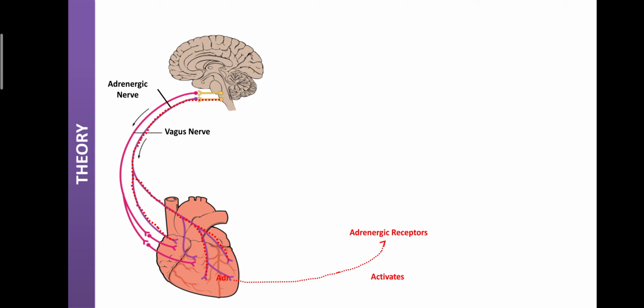Here the adrenaline and noradrenaline, through the beta 1 receptor, enhance calcium, and due to that accumulation of calcium, the force of contraction increases. So due to the increased firing capacity of the SA node, conduction of impulses and cardiac muscle contraction, the sympathetic system is responsible for increasing the heart rate and force of contraction.